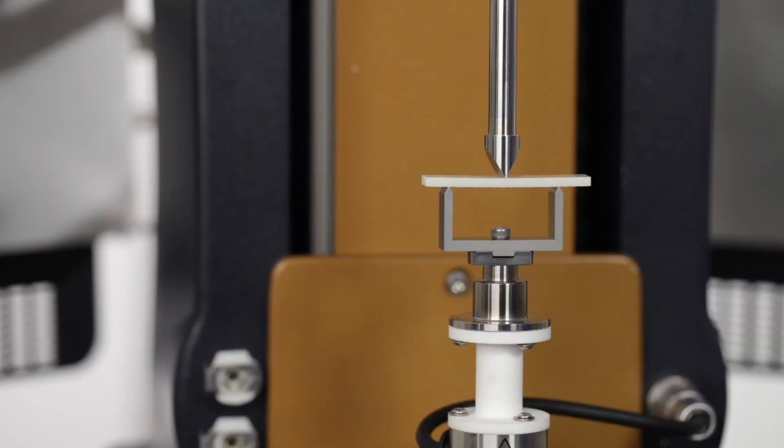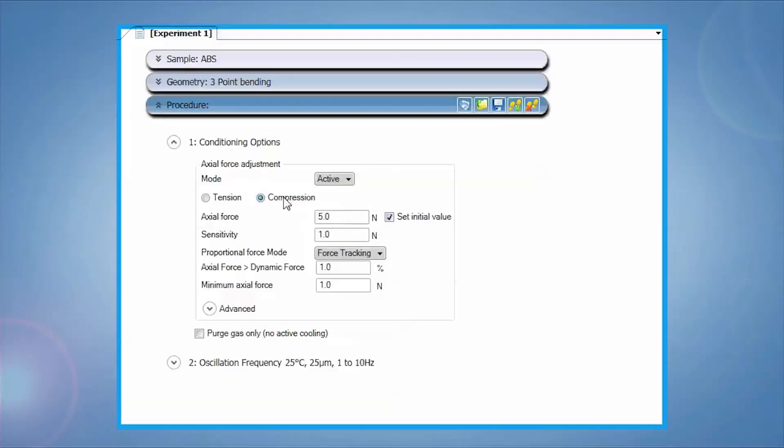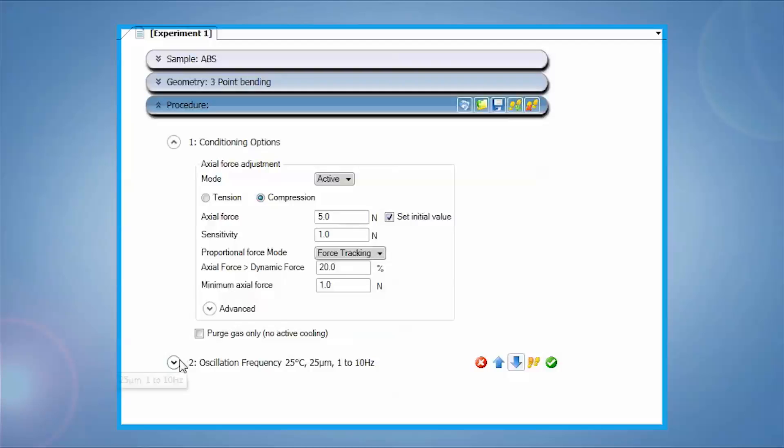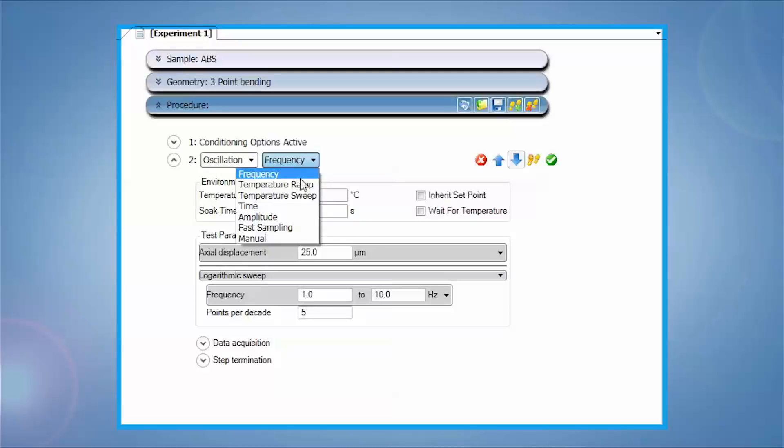The three-point bending clamp is now ready for testing. Test procedures include axial force control and compression to maintain contact between the geometry and sample during testing, followed by an oscillation step.